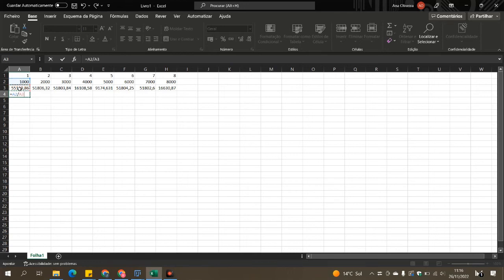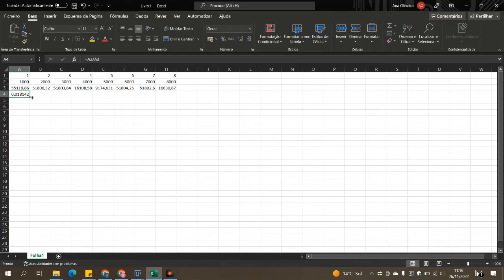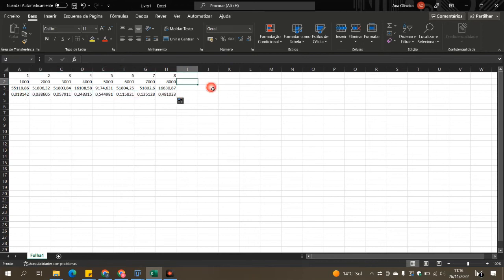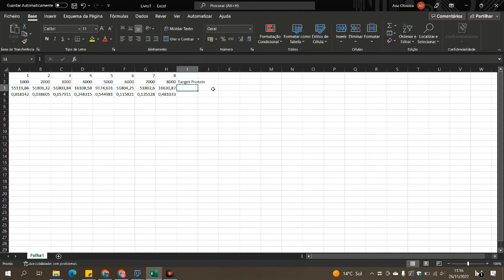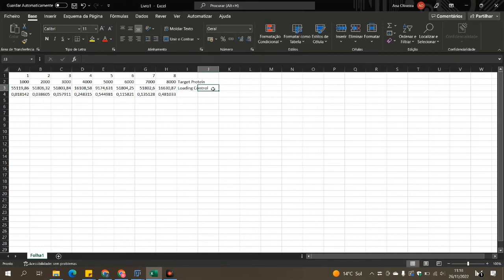So now I am just dividing the target protein area into the loading control one and putting the Excel file a little bit nicer with the naming around it.